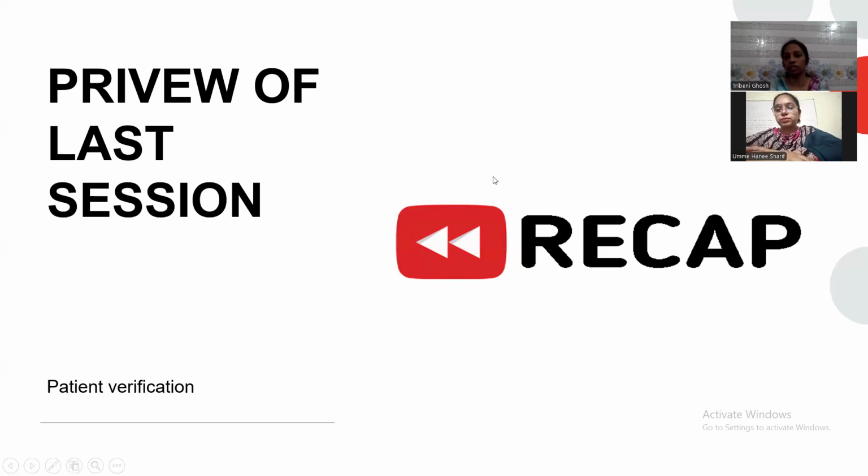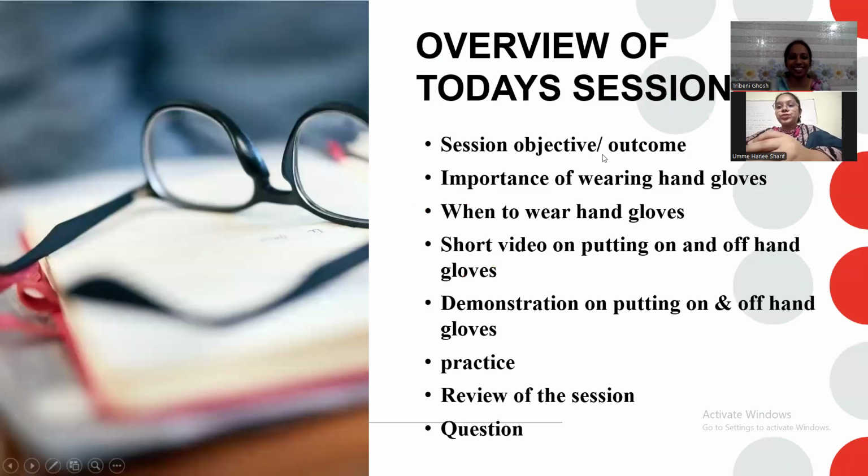Can you remember why it's important? Yes, I think because some patients have similar names, so we have to confirm their names, asking their correct spelling, so that we don't mismatch their names and cross contaminate the samples of their blood or any other kind of samples. Excellent. Thank you very much. You have been a good teacher, so I remember quite a lot. Thank you for your compliment.